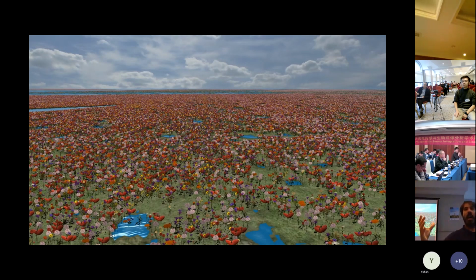So we did some pre-processing: we create a half-size version of the image, then a half-size version of that, and so on. It creates an image pyramid. When we zoom out, we can identify the resolution we actually need, and say we don't need the final resolution data, so let's pick a smaller level. It's basically like Google Maps.